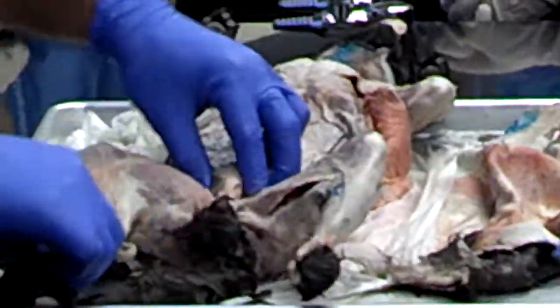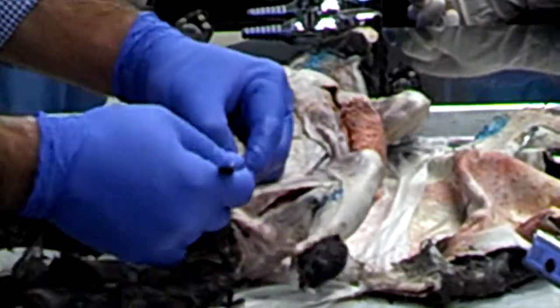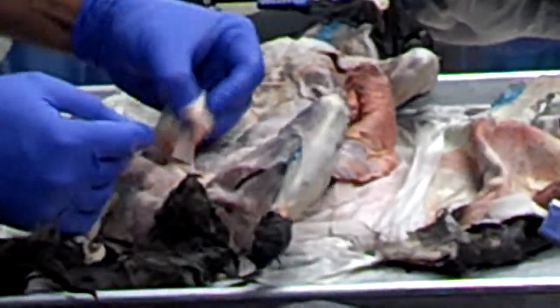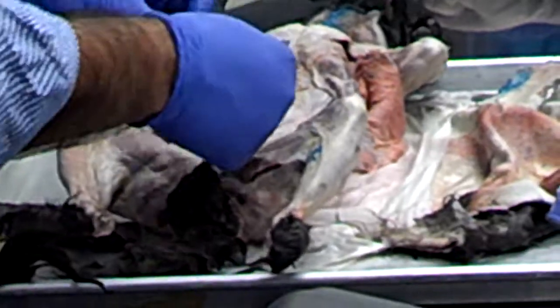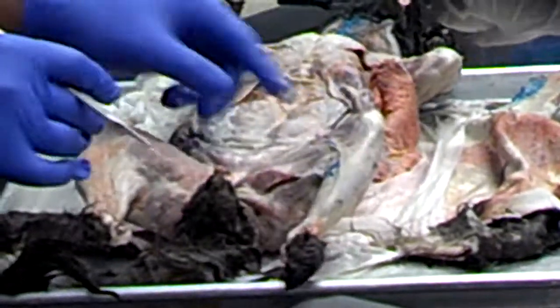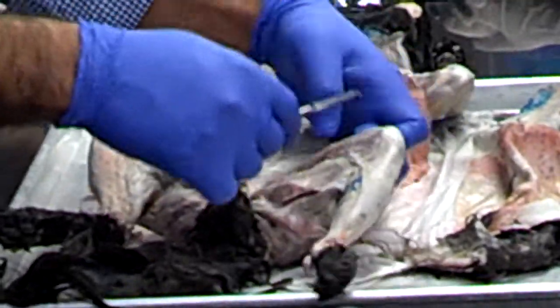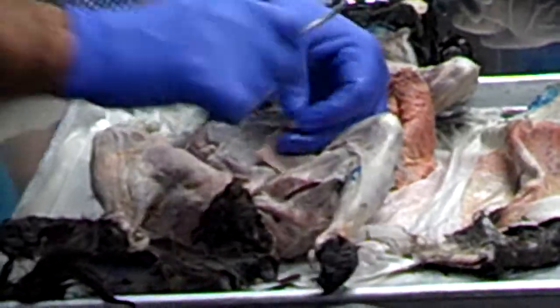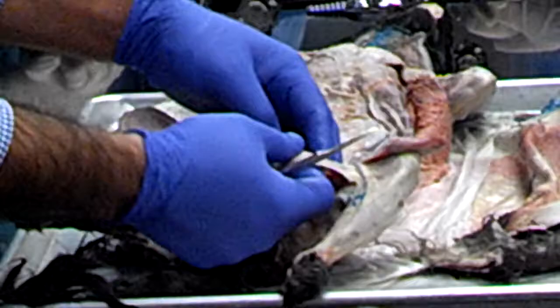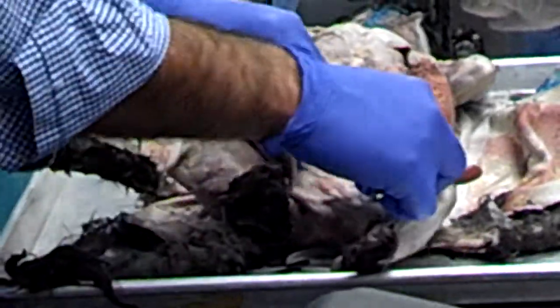Now, to see the deep muscles, I'll remove this chunk of fat from here. You have to cut these right in the middle. Don't cut at the end, okay? Right in the middle, I will cut the sartorius and reflect it. Right here, I will cut the gracilis and reflect it.